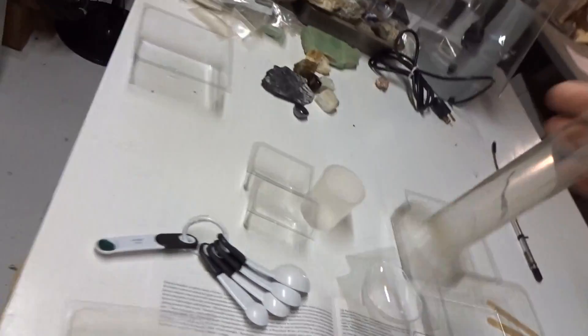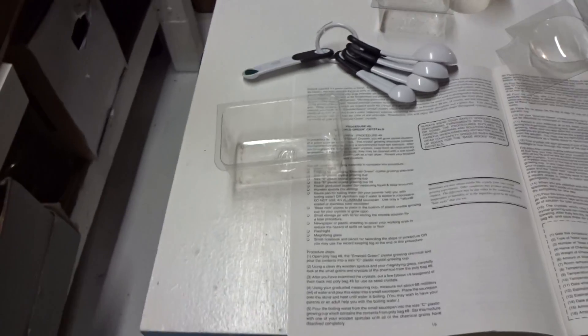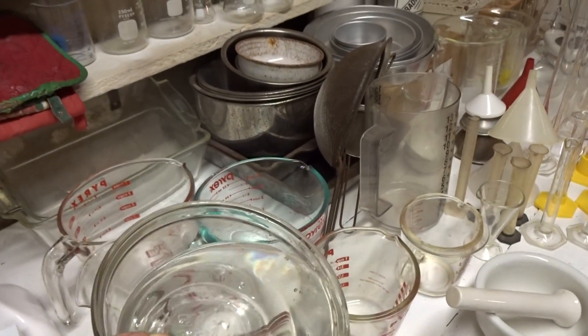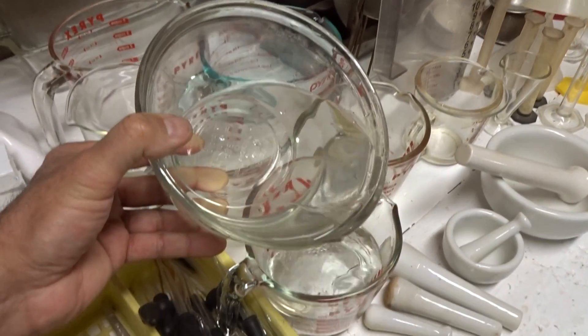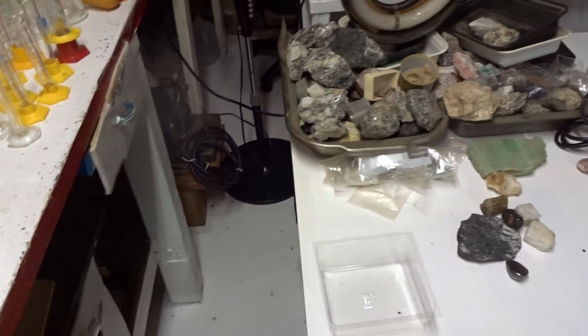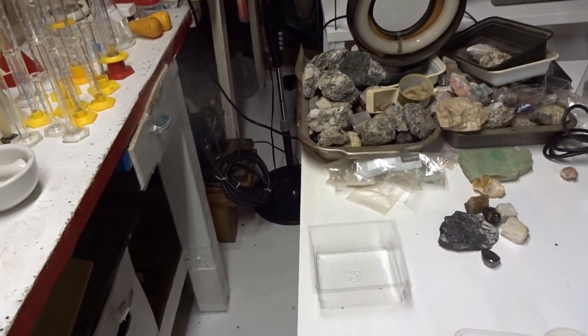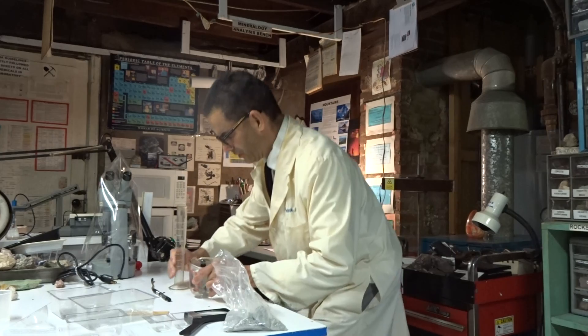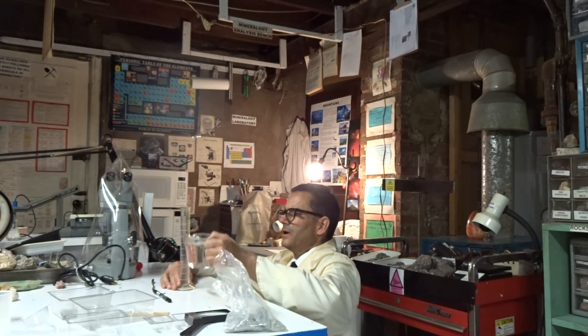Did you see what I almost did? This will never pour. Measure out 68 milliliters — I'll put you down and let you watch — using a graduated cylinder, 68.